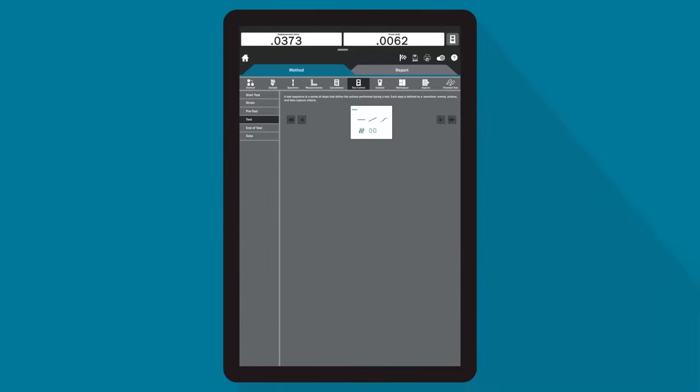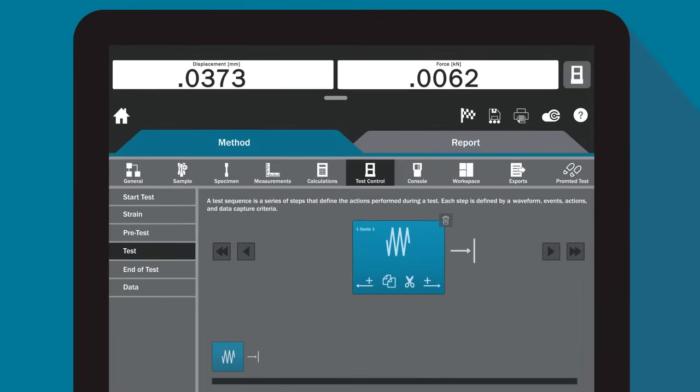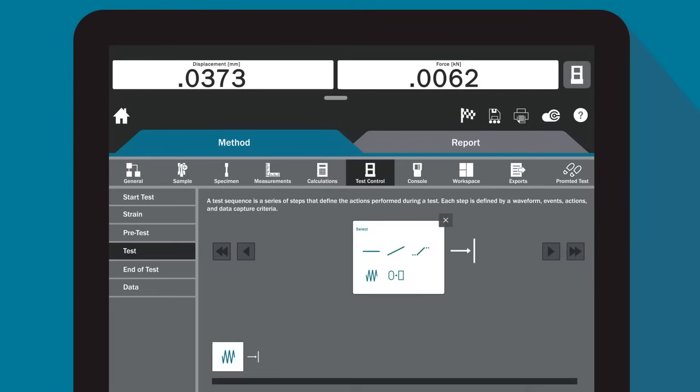For more advanced mechanical testing, Bluehill Universal's powerful architecture gives you complete control of how you configure tests, allowing you to achieve optimal system performance.